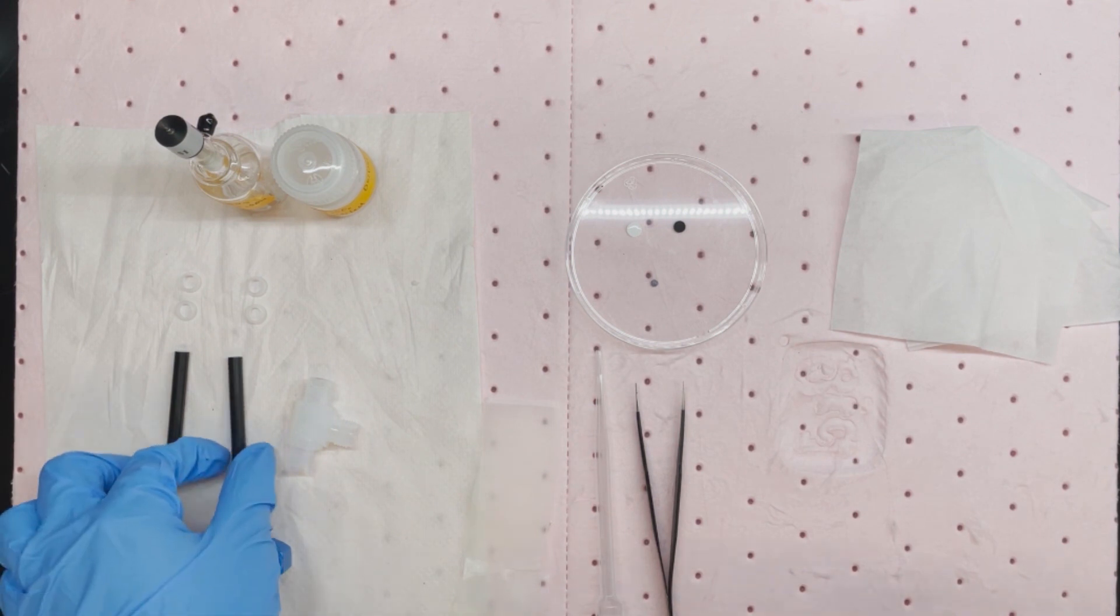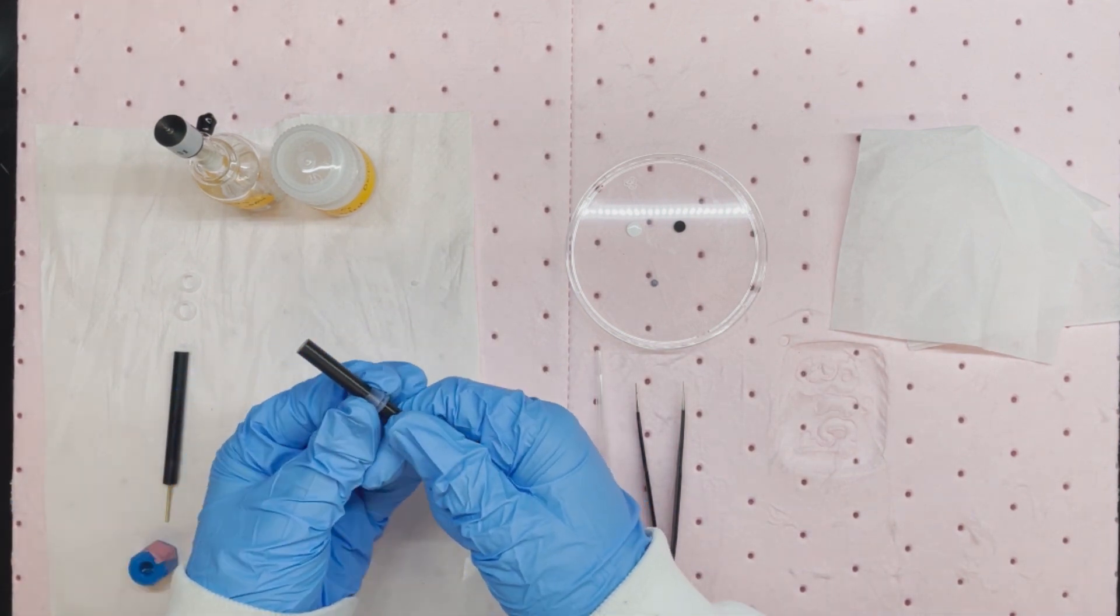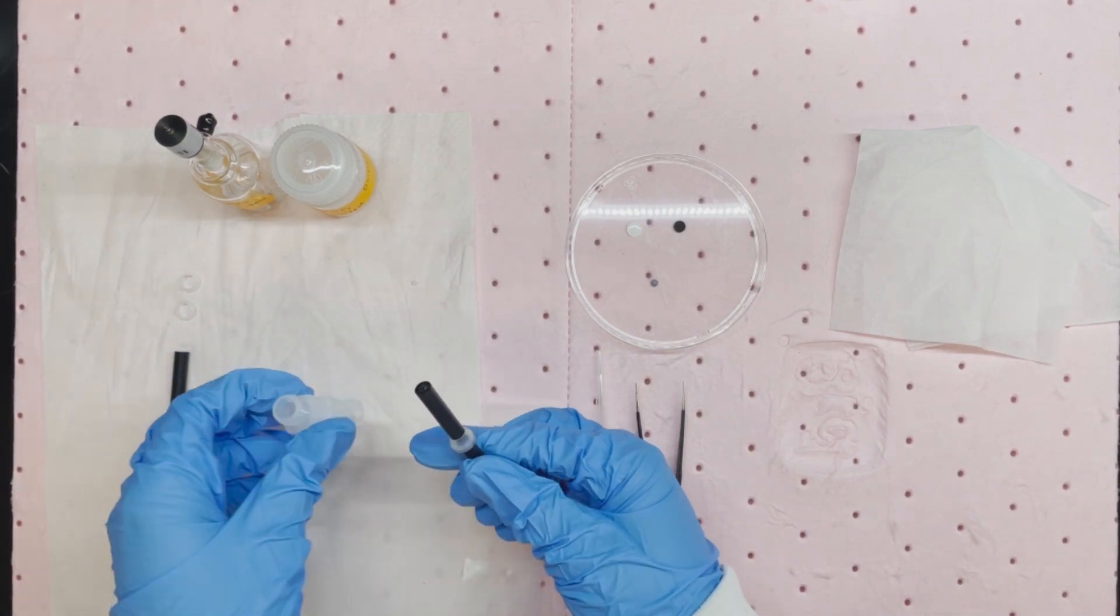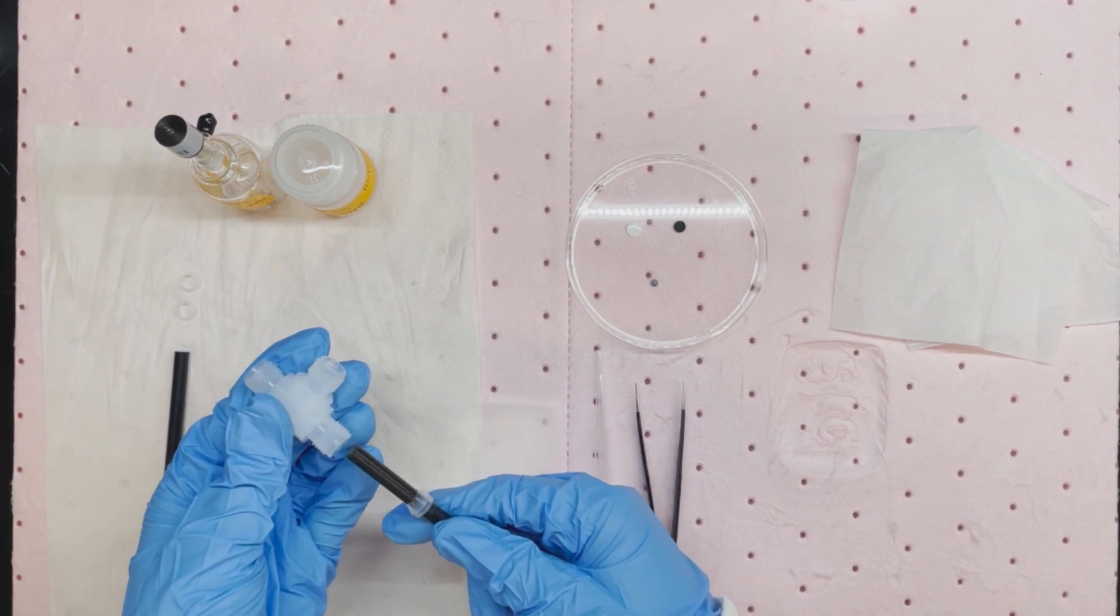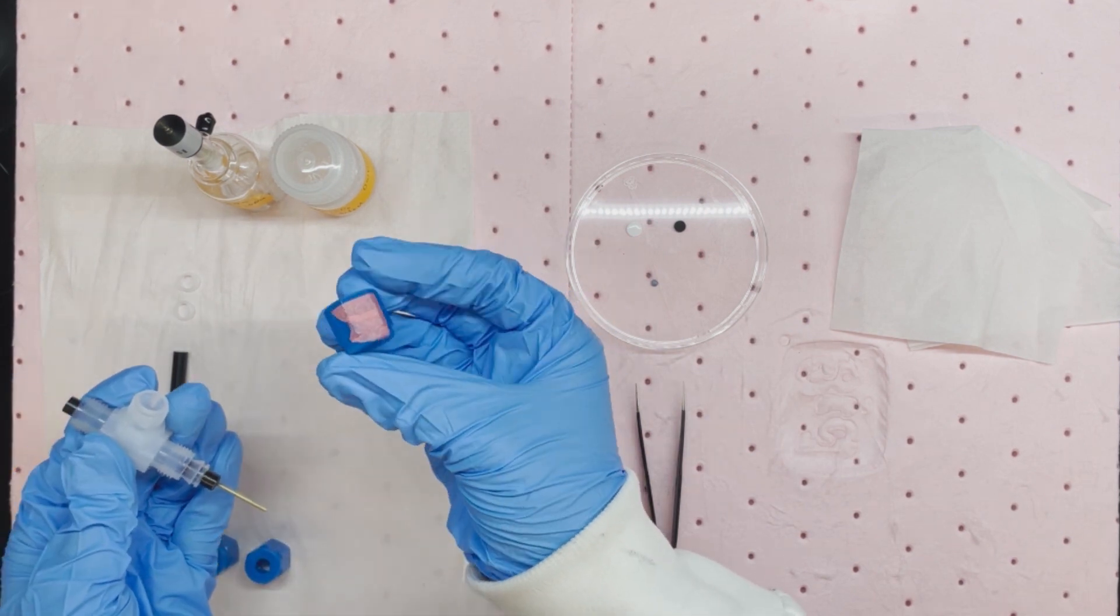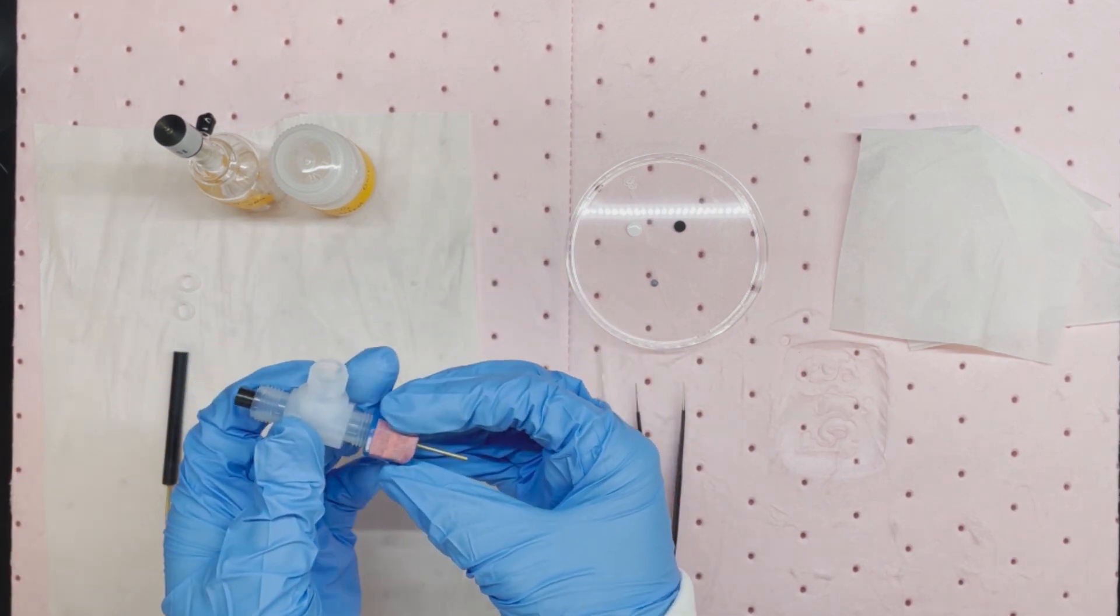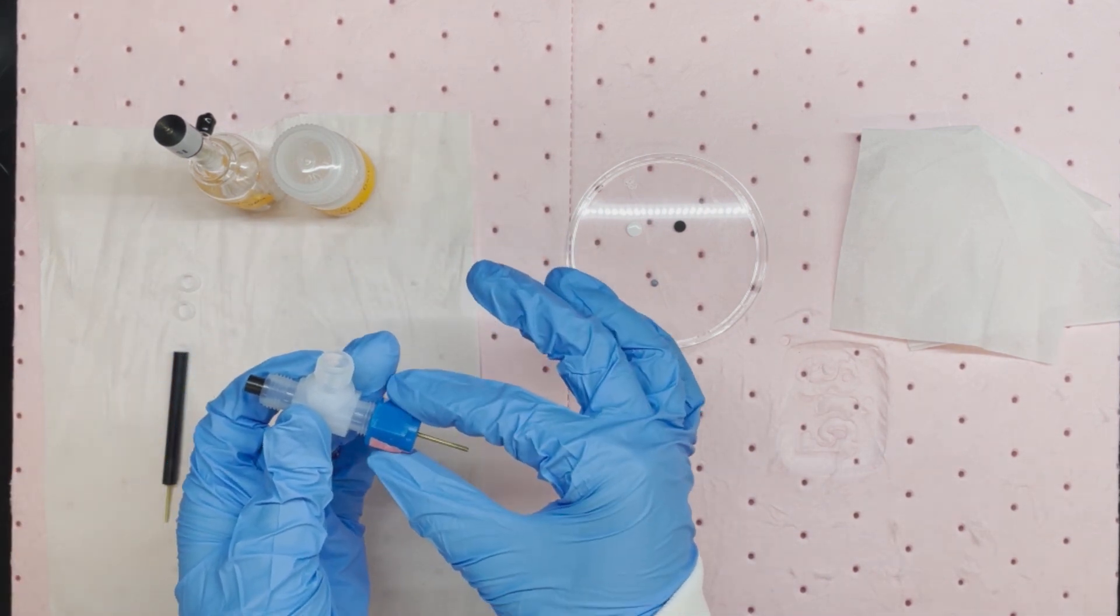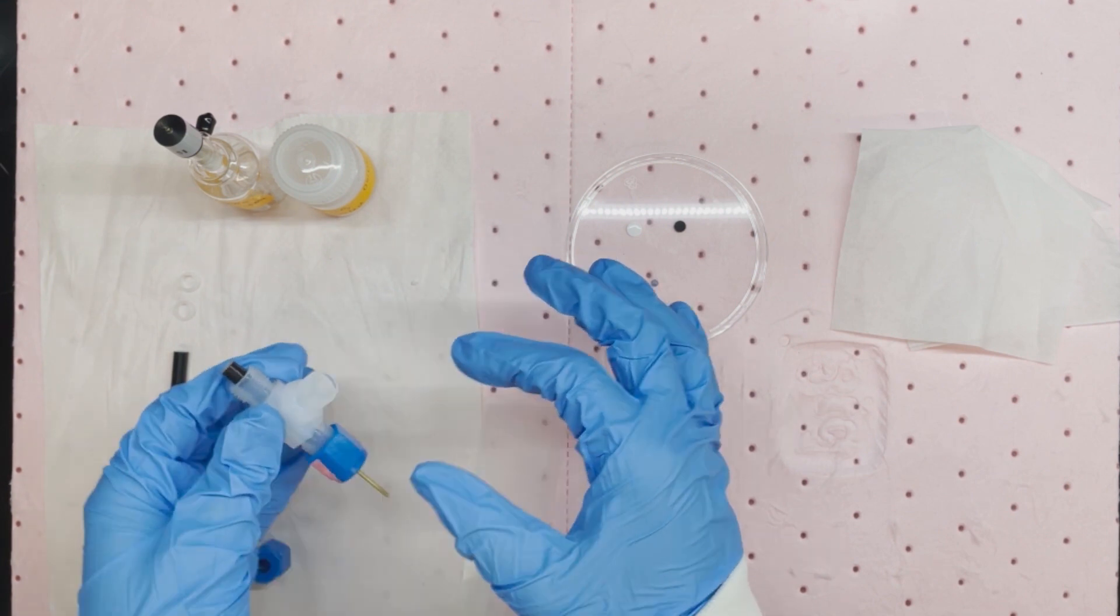To assemble the swagelok cell, we first install a gasket on a glassy carbon electrode and insert the electrode into the swagelok cell body. Make sure the electrode goes through the cell body to assist working electrode placement later on. We loosely screw the cap to help fix the electrode in place.